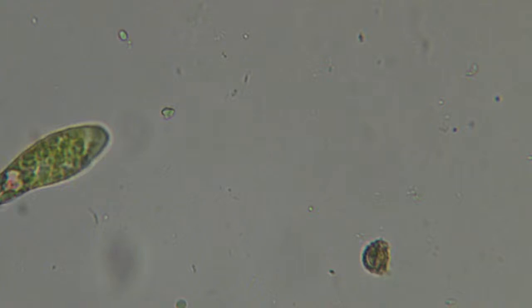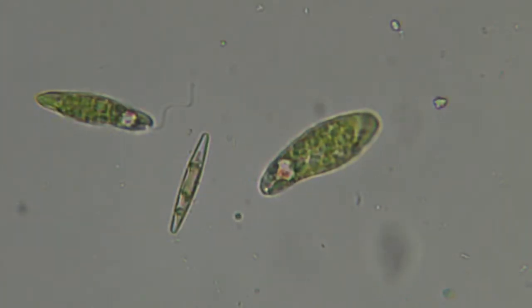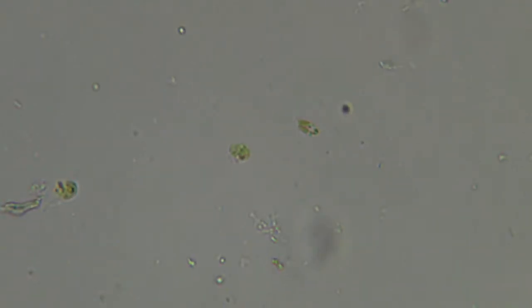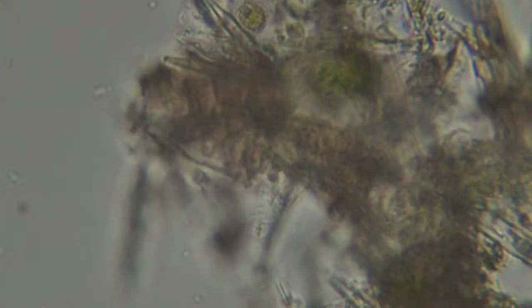Gonna look to the other side so I can see the whole slide. There to get there. Oh, here it comes. All right, let's just scan up here real quick. Lots of. That's a really good shot, Euglena in the high spot. More little debris forests with thingies in there. All kinds of thingies collecting. More Euglena. There's a flagella going crazy there. Doing the wiggle.